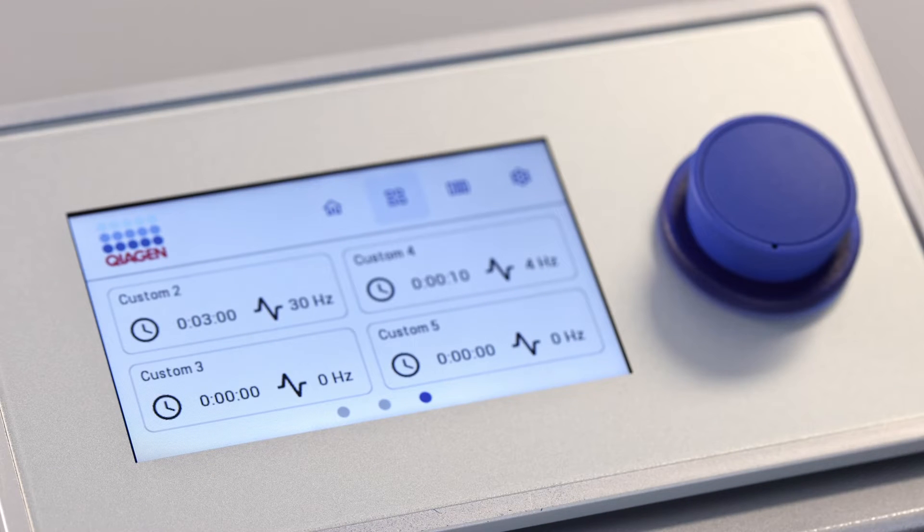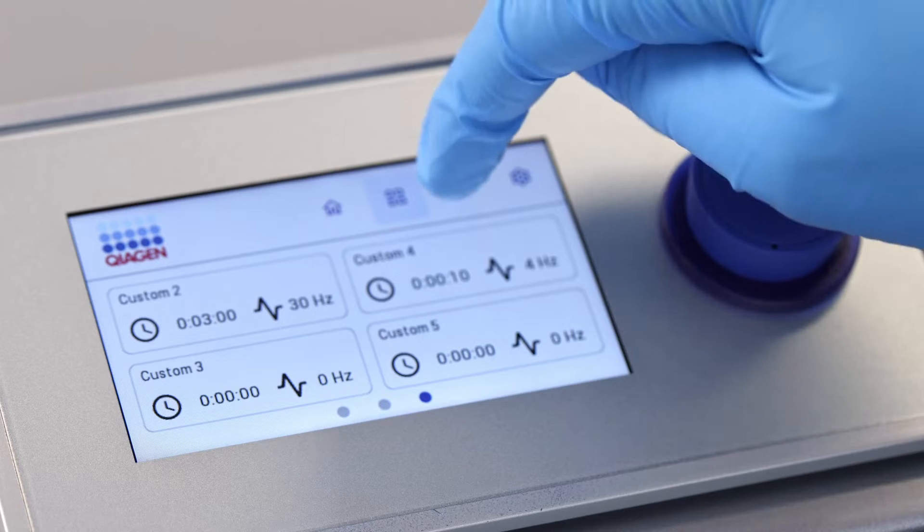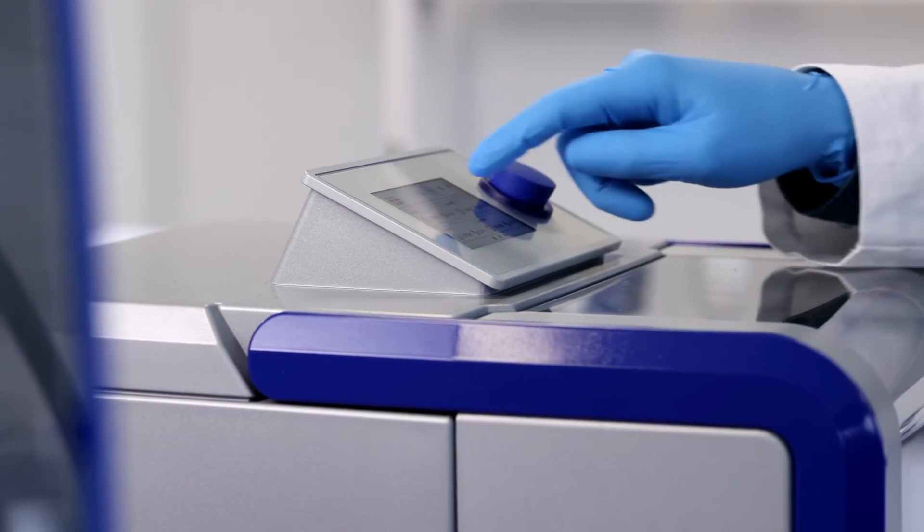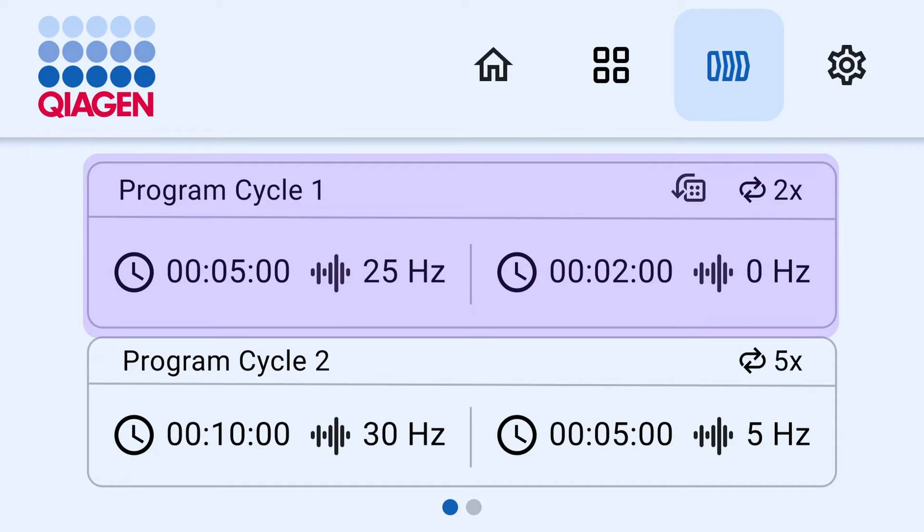The Tissalizer 3 also has customizable program cycles. For example, a program cycle allows you to pause the disruption run periodically. Press on a program cycle to edit or run it.